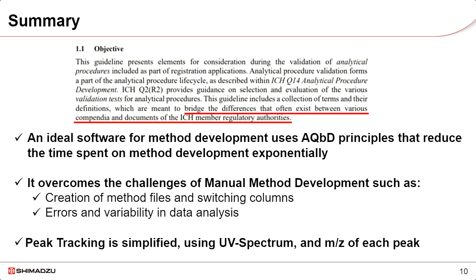When doing method development through an AQbD approach, an analyst's experience will often dictate how they interpret the regulatory guidelines when developing the method, and they'll approach the data when landing on an analysis method, building those aforementioned bridges on their own accord. Now, what if I told you that Shimadzu has its own offering of a software that builds these bridges for you? LabSolutions MD is meant to be your bridge builder by automating creation of method files, tracking peaks of importance across method candidates, and optimizing analysis conditions, regardless of an analyst's experience with method development.